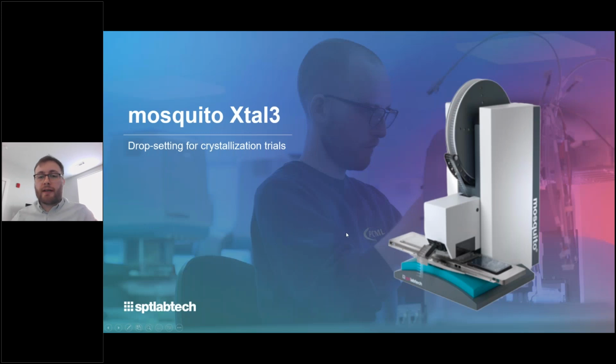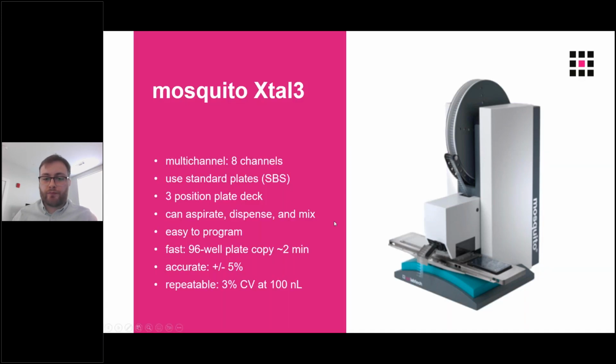The first instrument I'm going to talk about in detail is the Mosquito Crystal 3, which is the drop setting instrument for crystallization trials. So just to go over some specifications and overview, the Mosquito Crystal 3 has 8 channels, 8 tips below the head, which can aspirate, mix, or dispense.